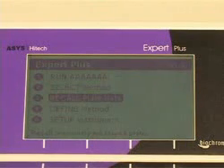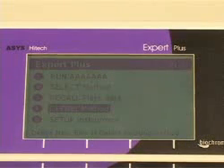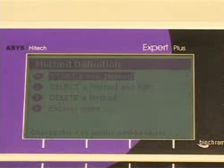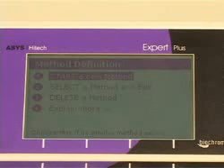When defining a method, you can start a new method or edit an existing method, as we're showing in this video.